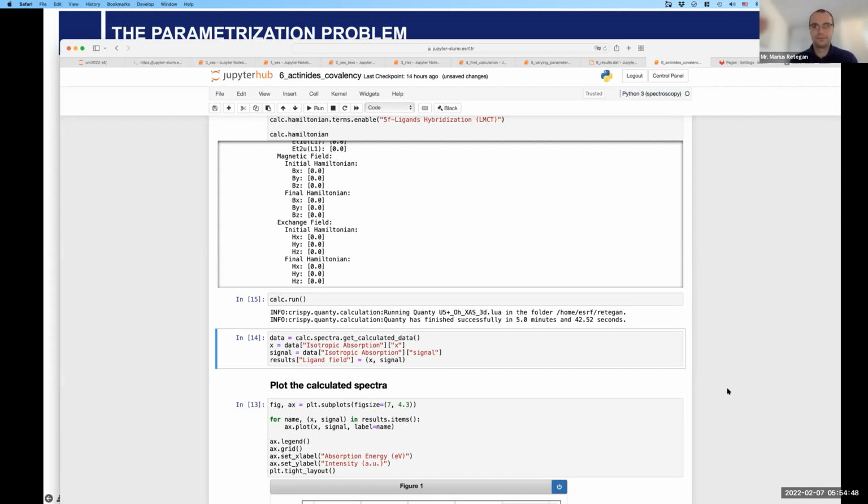And it's a similar situation with respect to ID26: if we are not doing something at a spectroscopy or beamline which has a user community, or which had a person who developed this code with a graphical user interface, we have no option other than to learn Python.